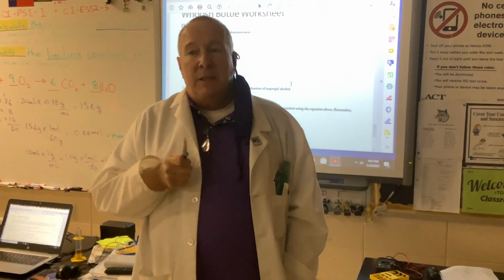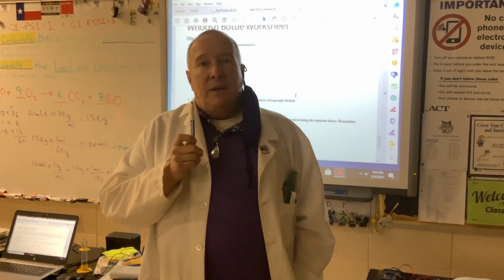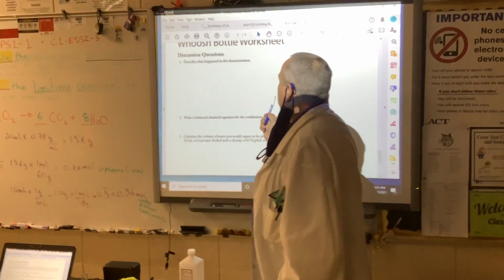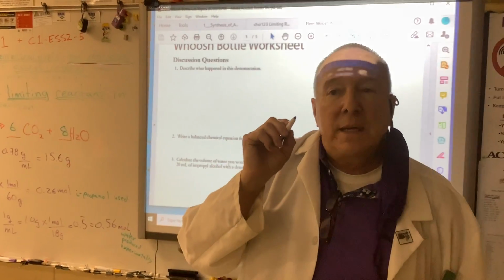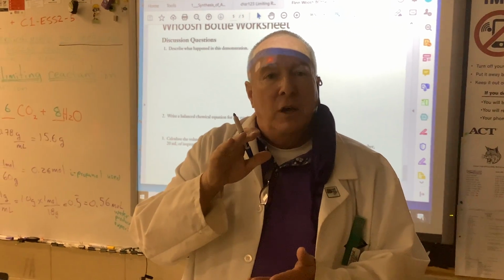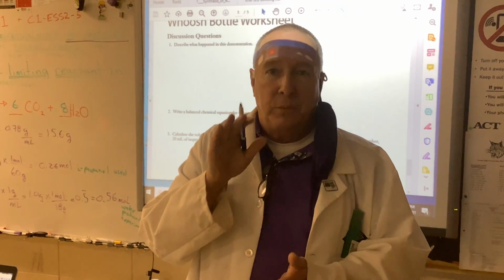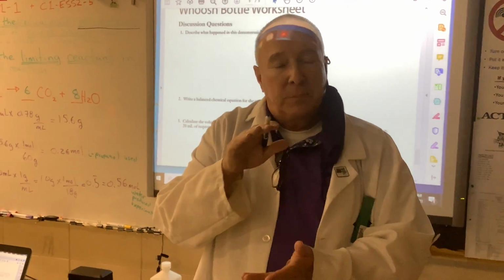But in this reaction, you saw the following. Now, the first question says, what happened in the demonstration? And what we did was we took 20 milliliters of isopropyl alcohol, 91% isopropyl alcohol, but we won't make a correction for that, not being 100%.